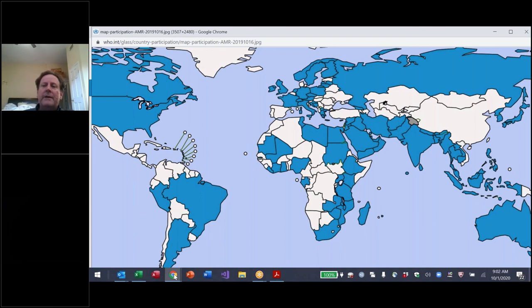And then on top of that, there is the official data element about resistance. It has been renamed to GLASS AMR, I think. GLASS is incorporating a lot of new modules. GLASS for isolate level fungemia, your Candida in blood. They have another one on consumption. They have another one on whole genome sequencing. They will be incorporating the One Health aspect of food and animals.